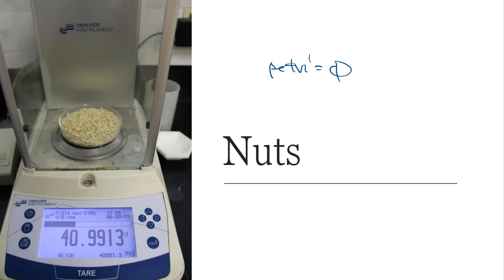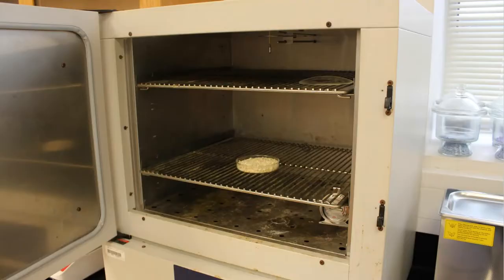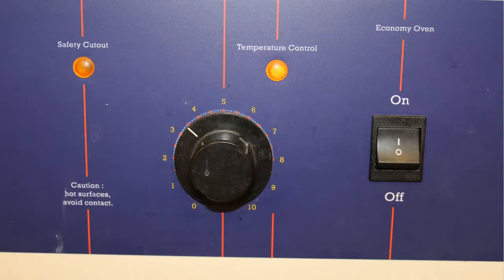All right. Okay, so now we need to calculate the percent of water. So what I do is I go to one of our ovens, I open up the oven door, and I put that Petri dish with all of my peanuts in the oven. As you can see, nothing else was in that oven, really. I kept it pretty clean. I was proud of myself for that day. And I turn the oven on, and the setting here, you can write down that setting. I don't have to tell you what that setting is supposed to be.